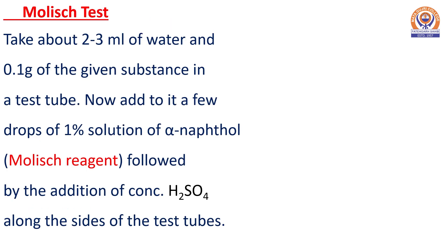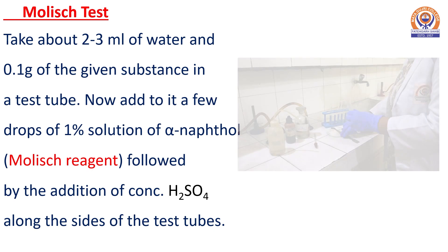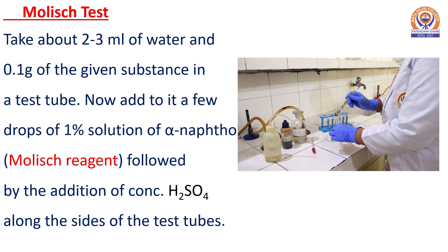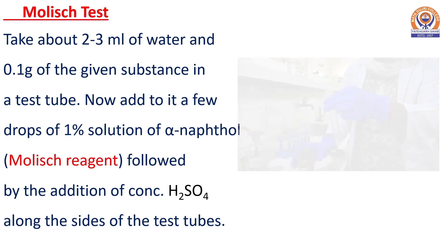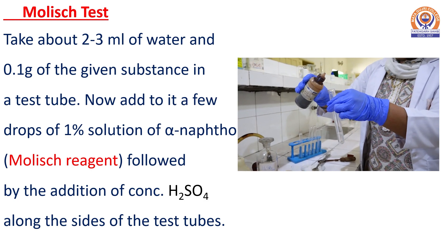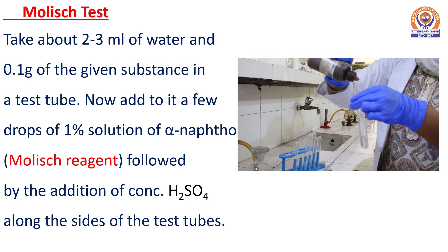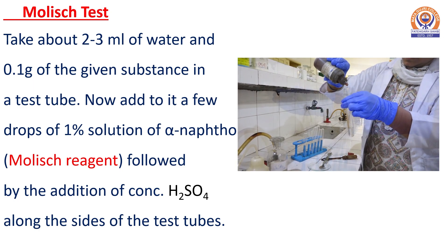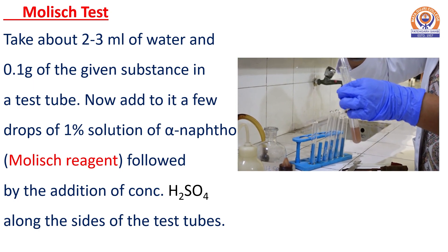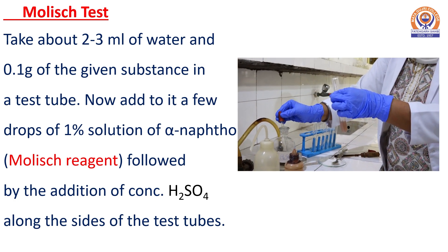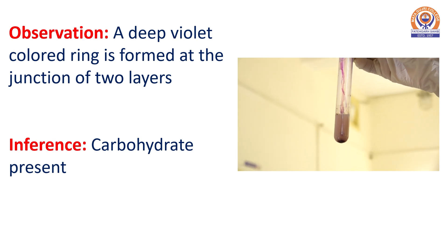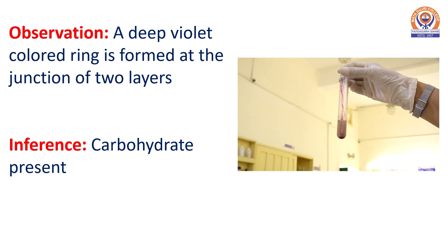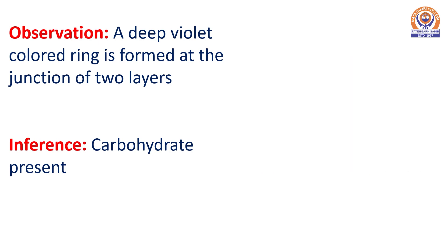The next test is the Molisch test. For this, we take 2 to 3 ml of water and 0.1 gram of the given substance in a test tube. We add a few drops of 1% solution of alpha-naphthol — that is the Molisch reagent — followed by the addition of concentrated H2SO4 along the sides of the test tube. We observe that a deep violet colored ring is formed at the junction of the two layers, indicating that a carbohydrate is present.